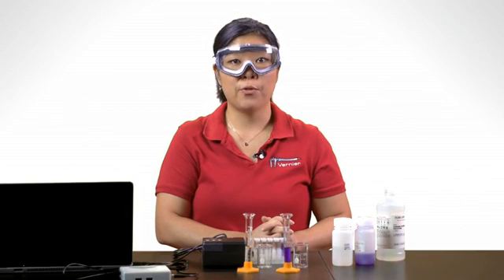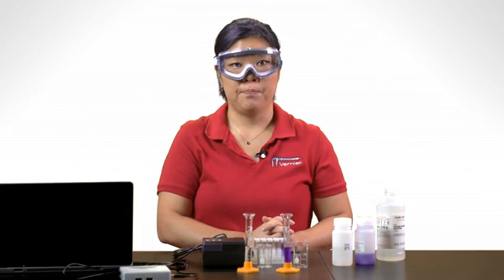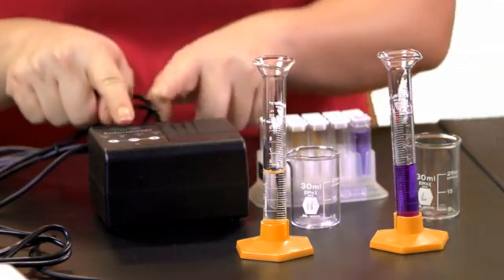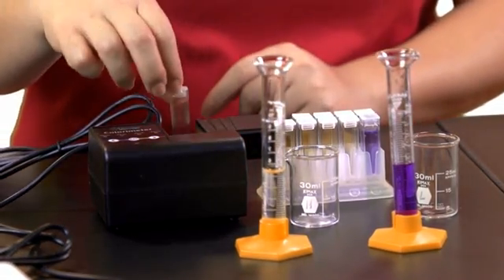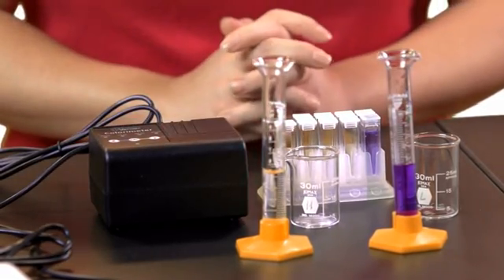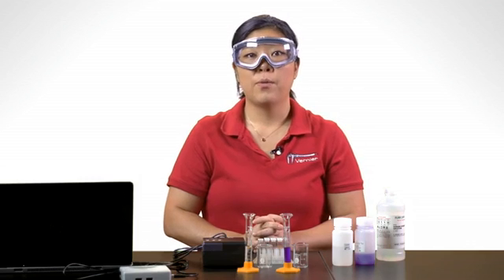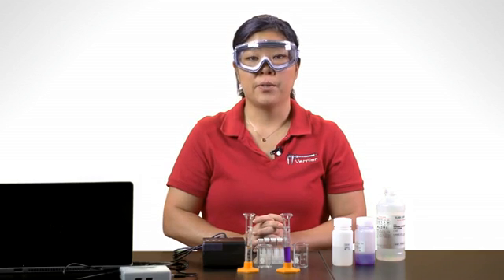Launch Logger Pro 3 software on your computer. Next, we'll calibrate the colorimeter. Place your blank of distilled water and then press the Cal button on the colorimeter. When the red LED stops flashing, the colorimeter is calibrated.